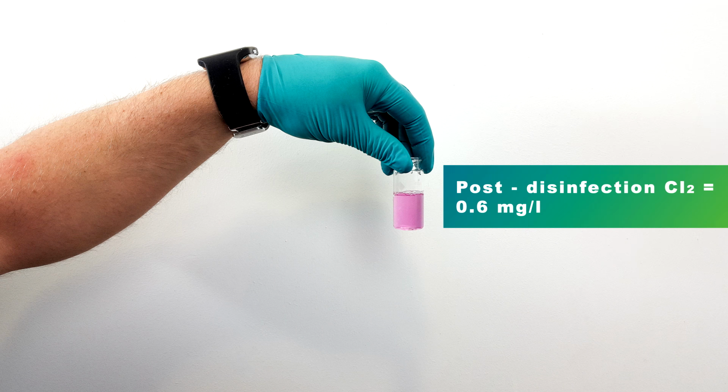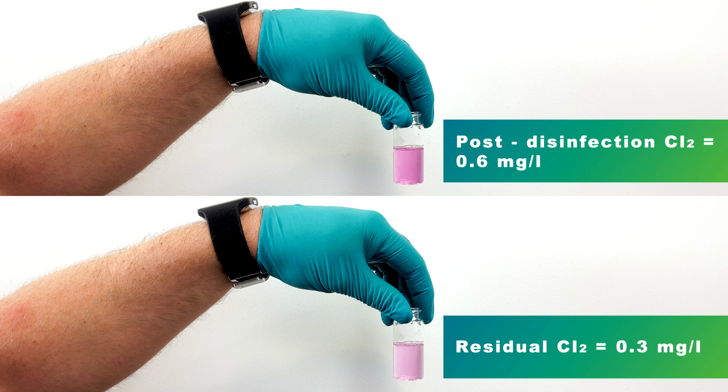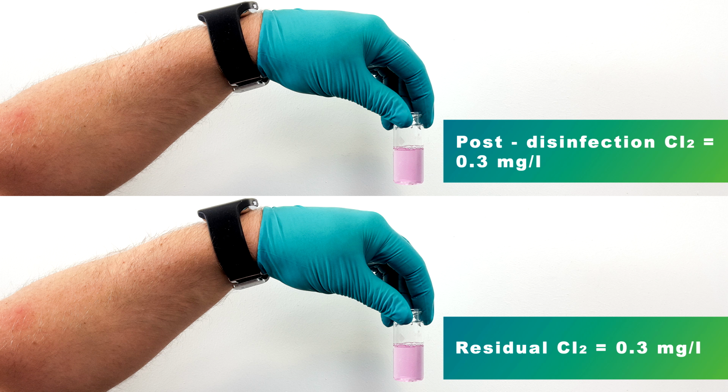In this example, the post-disinfection chlorine level has been measured at 0.6 milligrams per litre. Clearly, this is more than 0.1 milligrams per litre higher than the residual chlorine reading we took before disinfecting the tap. As such, the 30-second flush has proved inadequate. Consequently, the tap should be reflushed for a further 4 minutes to purge any remaining hypochlorite solution. Once chlorine levels have returned to pre-disinfection baseline, you're ready to proceed with your microbiological sampling.